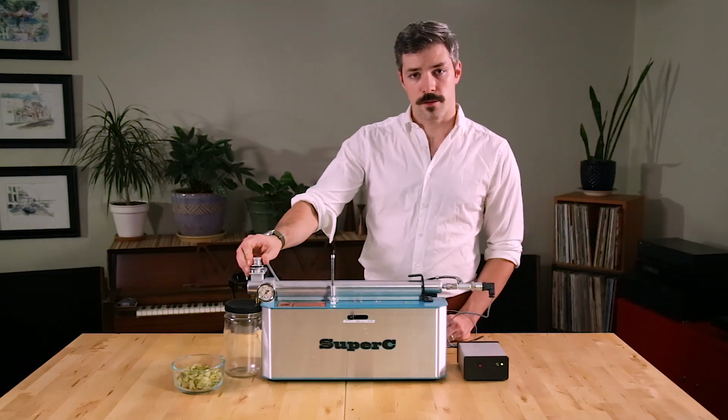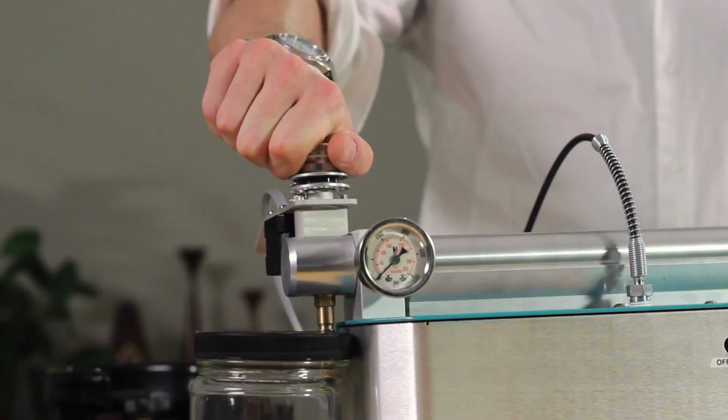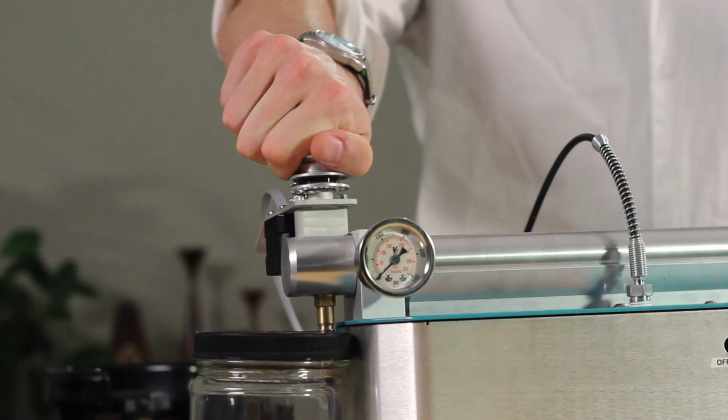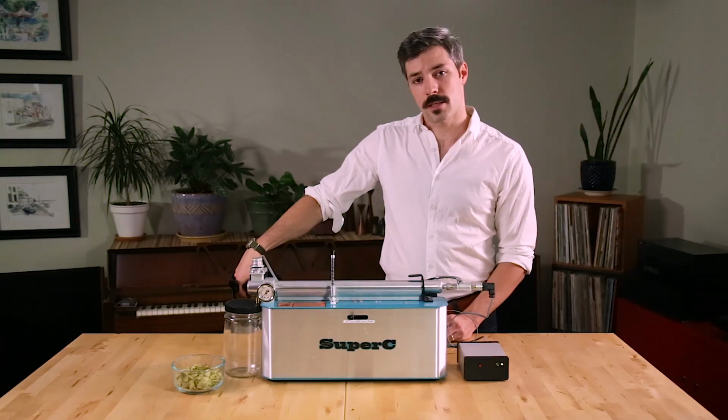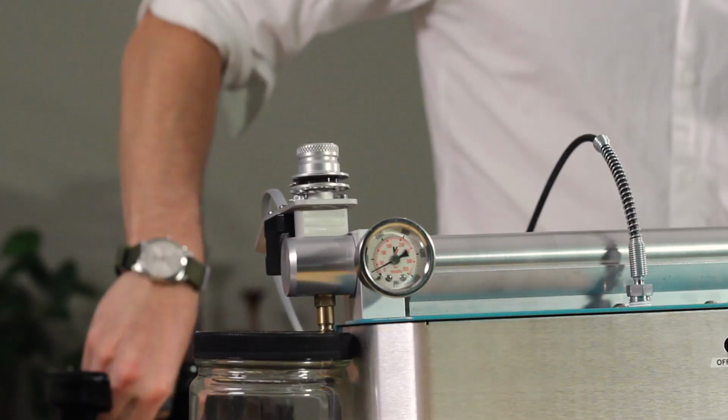To do this, we want to close our valve. Once the pin is snug, that's enough. We only need the gas to be stopped. Anything tighter than that can damage your valve. Once that's closed, we can open our tank and listen that the back check valves are sealing.